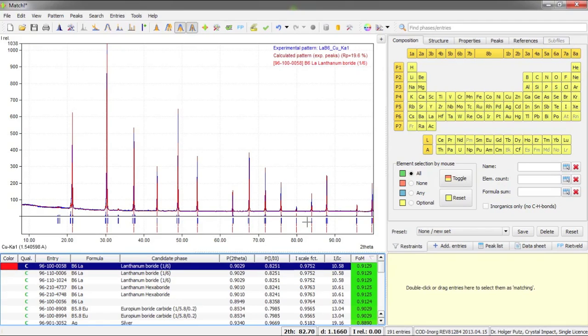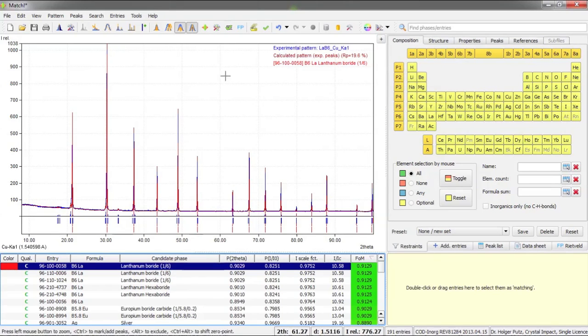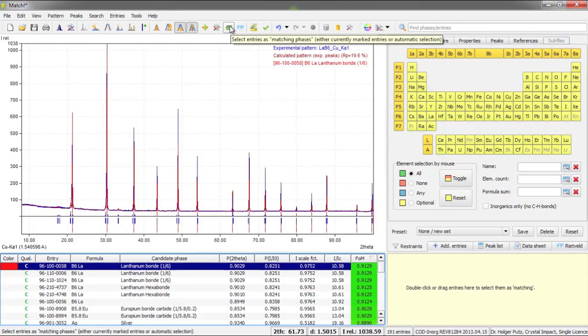The result can be seen here below in the candidate list. The most promising candidate phase is Lanthanum boride, which is no surprise actually. I will now select this phase as matching, for example by pressing this button here in the toolbar.